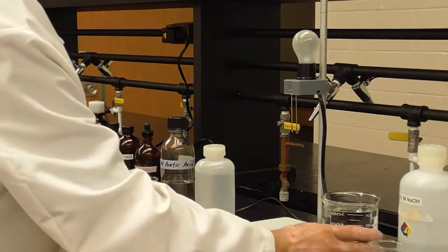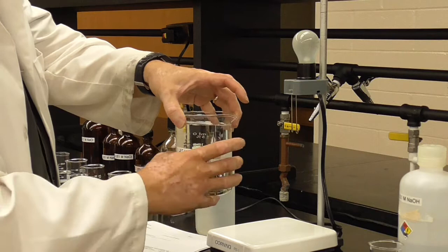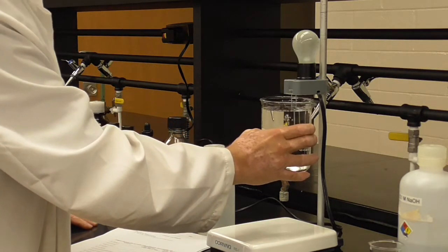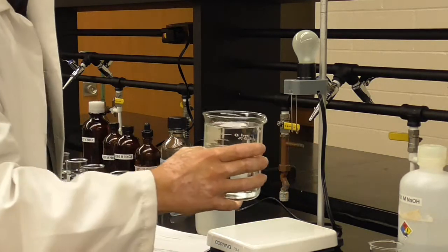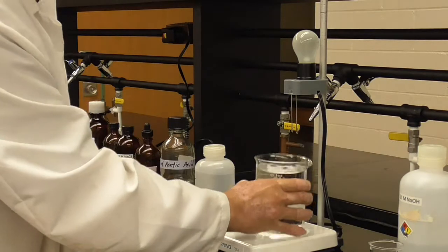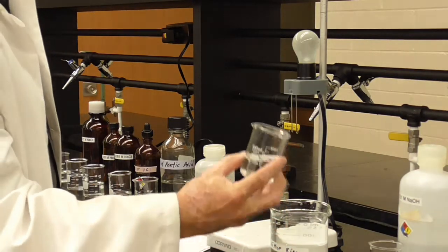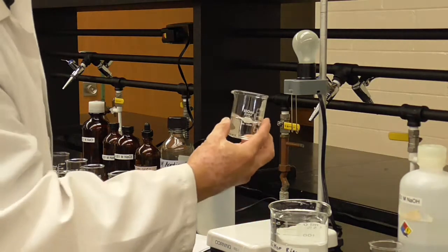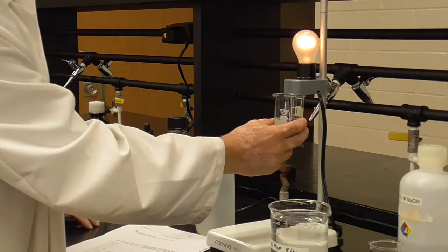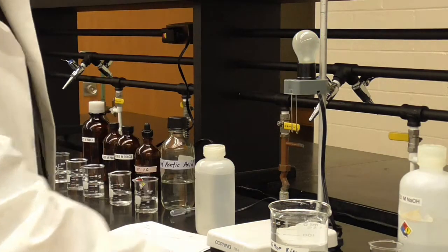And deionized water. That's what I've been rinsing it with all along here, DI water, deionized water. And you see when I put deionized water in, nothing. Which amazes a lot of people. I mean, here's water, it's pure water. Pure water does not conduct electricity. Water only conducts electricity when you have stuff dissolved in it like tap water has. Tap water is not pure, it's got iron and other minerals and such dissolved in it. And that's what makes it conduct electricity. Okay, we made it through the whole list.